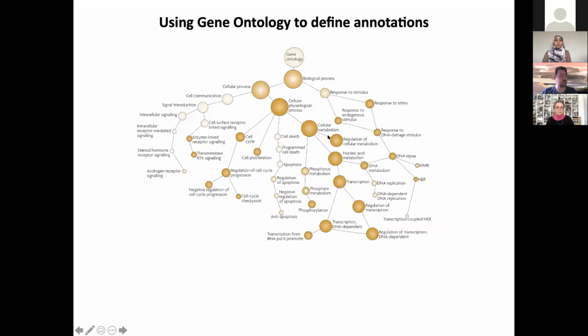So we can apply this approach to any gene function. Based on gene ontology, I selected gene ontology terms that have between 100 and 500 genes. So not very general, not very specific. Then we apply this to learn the phenotypes associated with these different functions, and basically have multiple rankings for each gene.